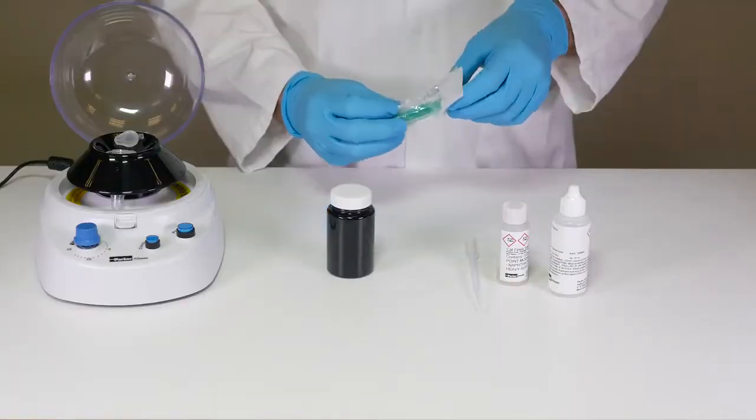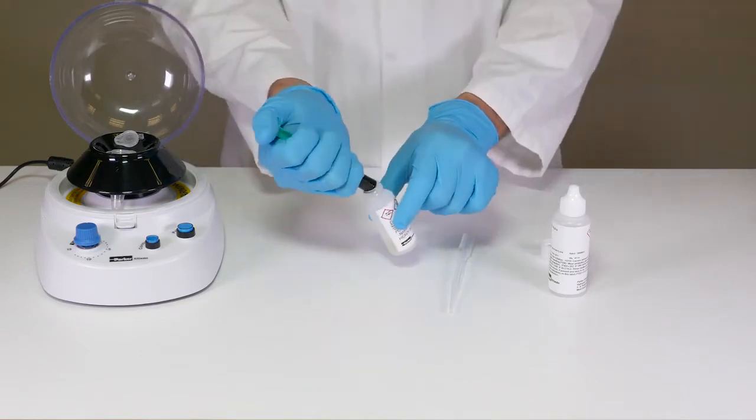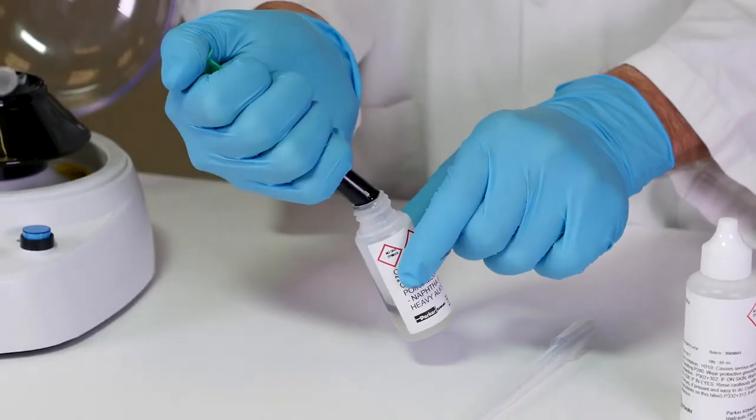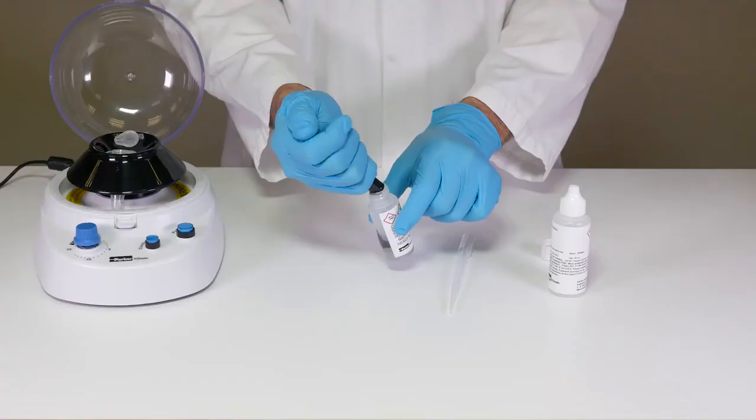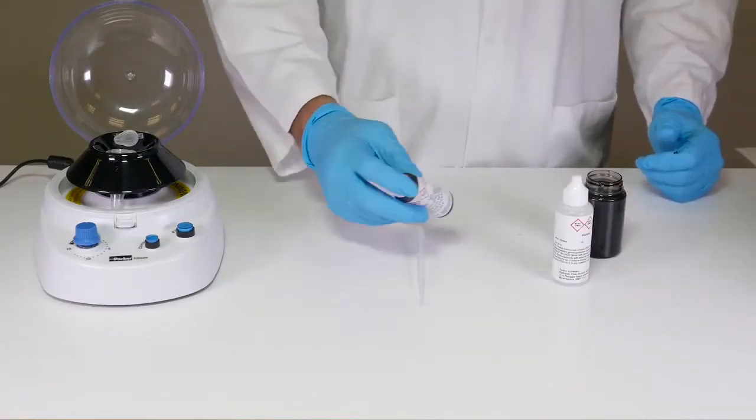Completely fill the five milliliter syringe with heavy fuel oil sample. Add all of the heavy fuel oil sample in the syringe to the cat fines test fluid bottle. Replace the cap and shake vigorously for three minutes.